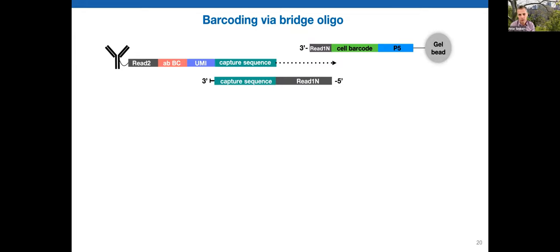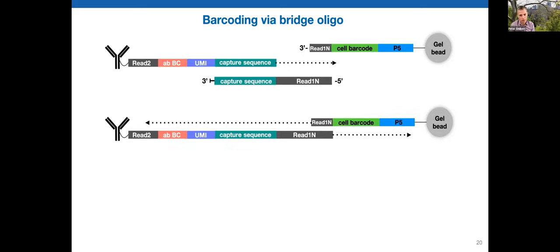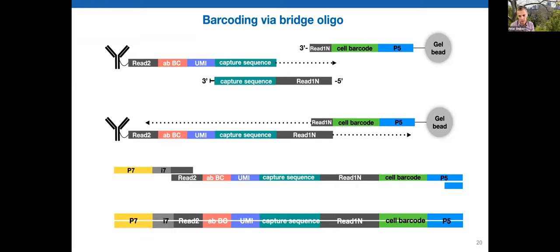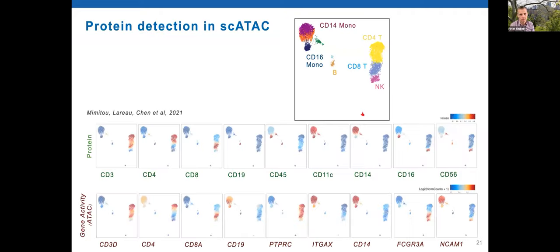So we recognized that we could throw in a bridging oligo. This is schematized here in the middle, where it's blocked at the 3' end. So by itself it can't extend, but it can serve as a template where the antibody-bound oligo will anneal to it. And then during these amplification cycles it will be extended, putting a new extension on the end of the oligo that makes it compatible with the oligos derived from the 10x Genomics product. This is what it looks like after extension. And then in subsequent rounds of linear amplification, the products emerge together and you can create this tag library that is sequenced together with your ATAC-seq library.